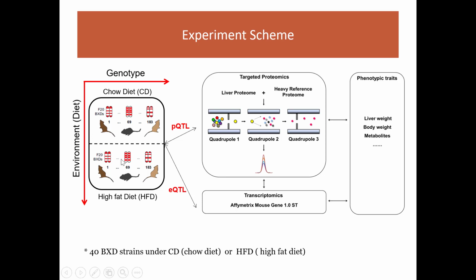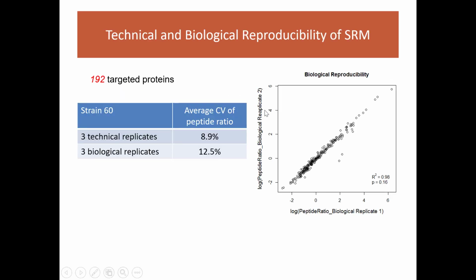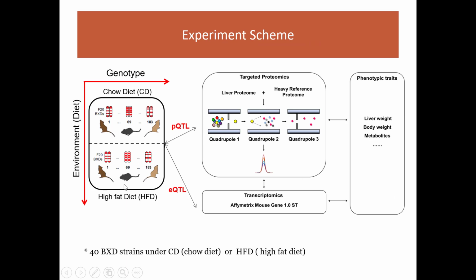And then we measured a number of proteins, in this case by SRM, but we've done the same thing also by DIA, but it doesn't really matter. The point I want to make is the same. So we could not measure all proteins. We could also not measure all strains, simply for throughput reasons. Now we probably get into a stage where we could do more of all the strains.